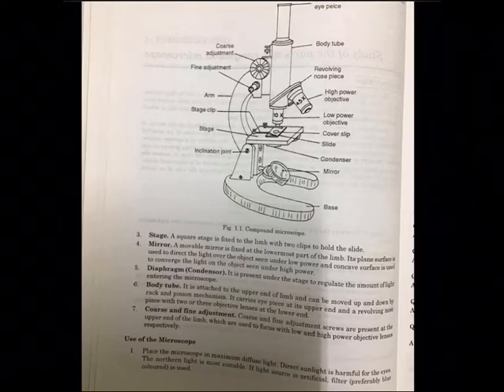It carries the eyepiece at its upper end, as you are seeing. The eyepiece is on top, and a revolving nosepiece with 2 or 3 objective lenses is at the lower end. As I said, in the disc you can see the 10x low power objective and the 45x high power objective. So this body tube, by having the ability to move up and down, can magnify the object. And then coarse and fine adjustment. You can see 2 round discs on the handle. The bigger round one is called the coarse adjustment and the smaller one is called the fine adjustment.